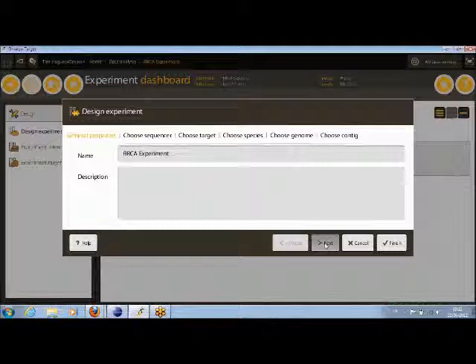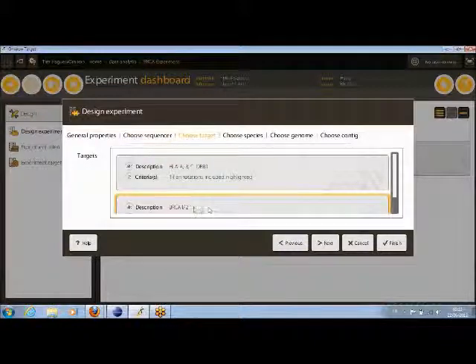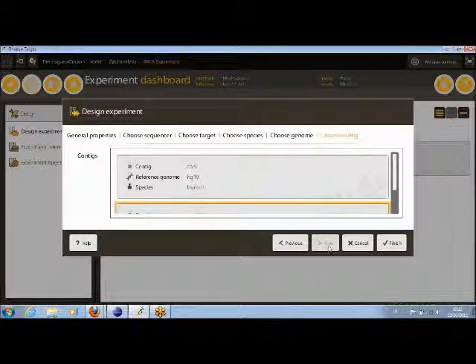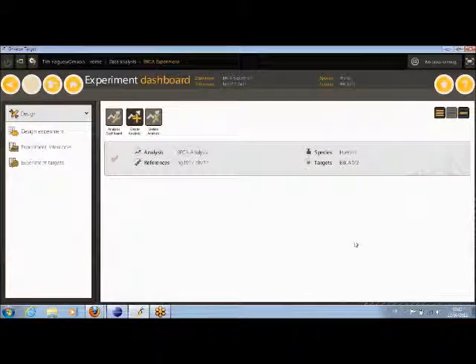So the idea here is that this will then make the processing for the various samples that you want to analyze a bit easier to do, because we've already pre-configured that we're working with Illumina, we're working with the BRCA target, we're working with human, HG19, and chromosome 17. This has already been configured at the experiment level, so we don't need to touch this again, and the mapping and alignment tools will automatically pick up all of this experiment and design within here.